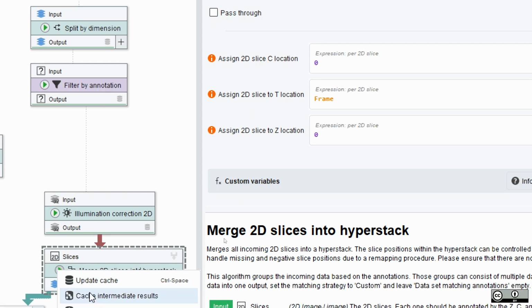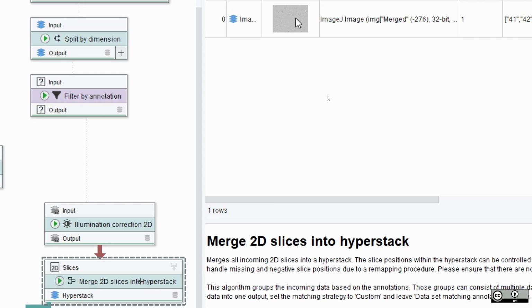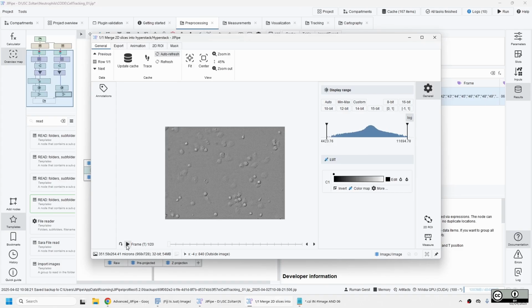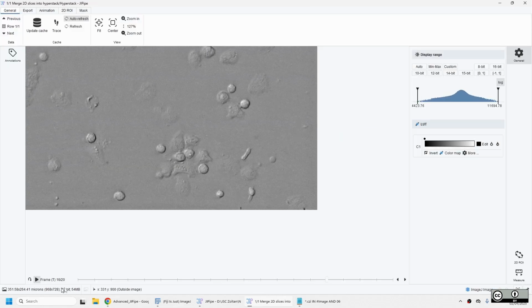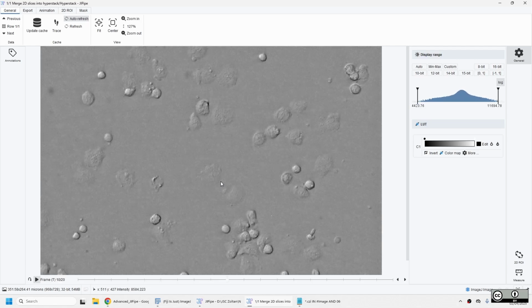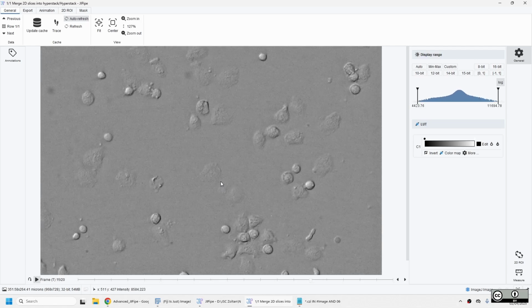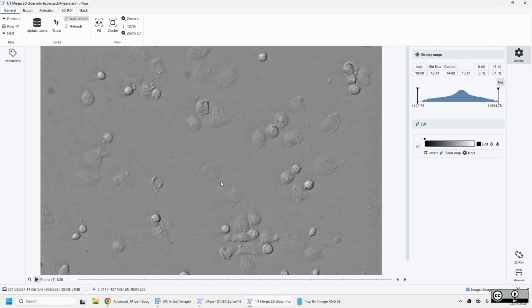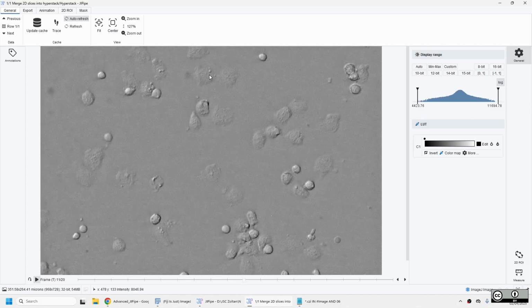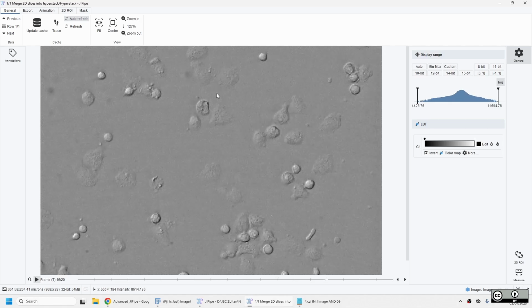And if I run this one, then what I have at the end is a time series. A time series of 20. So this one runs from 1 to 20. You remember we had a filter earlier, which we turned back on. If I turn that filter off, then this will be 121, but then it takes longer, like I said, so it doesn't matter. But now we have the images.